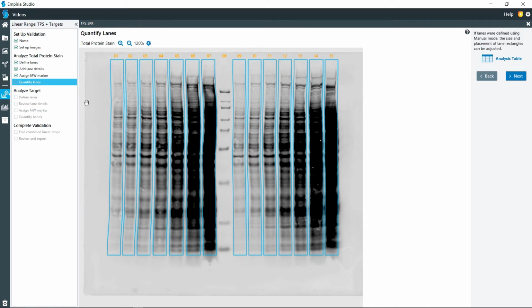And so for the revert, it will automatically draw the boxes over the shapes for you. Now, if you had, say, a different target on here, the process that you will use for placing the shapes on there, I'll show you in the next section.